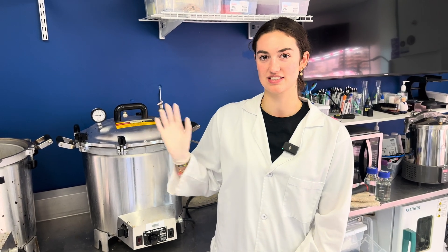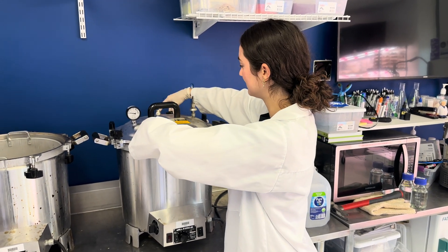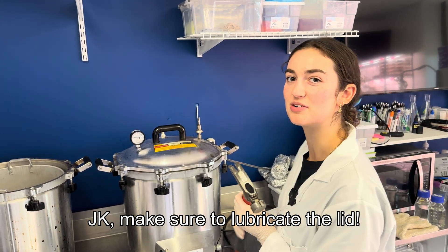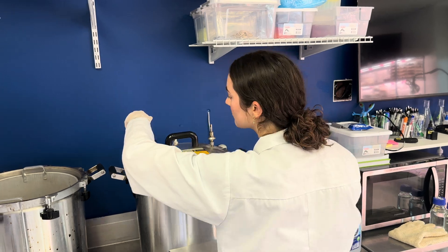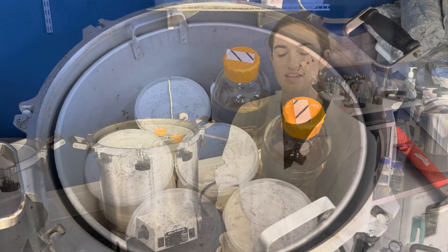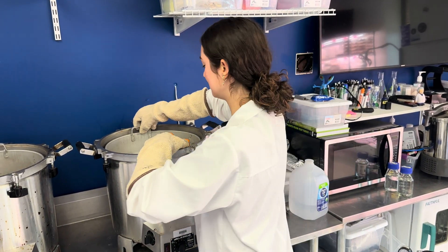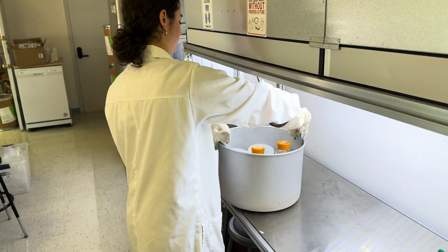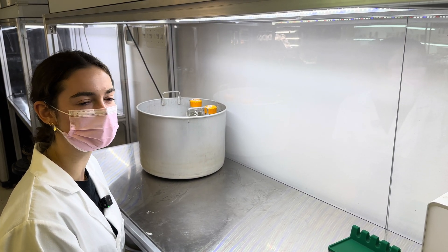Now that the pressure is down to zero, open the valve to release any leftover pressure and start unscrewing the lid. If your lid is still stuck on, grab a hammer or a crowbar to help open it. Make sure to use autoclave gloves to remove the media from the pressure cooker. Wait 15 minutes before taking your media out, because it is still very hot.